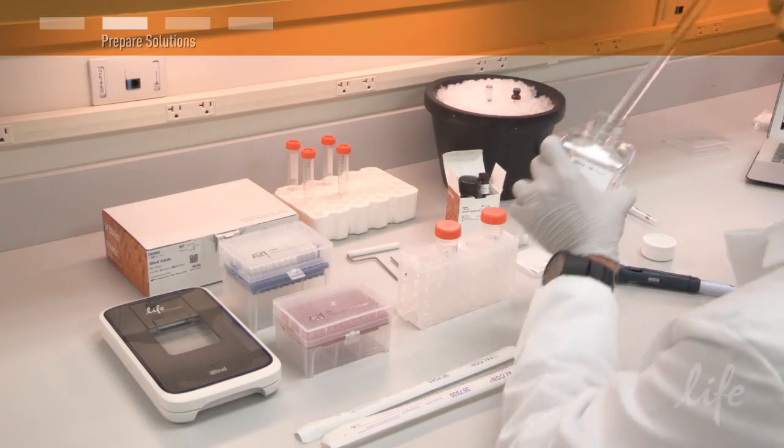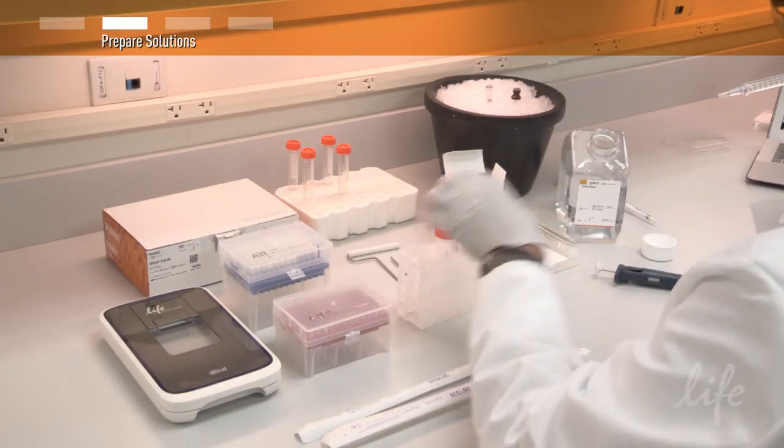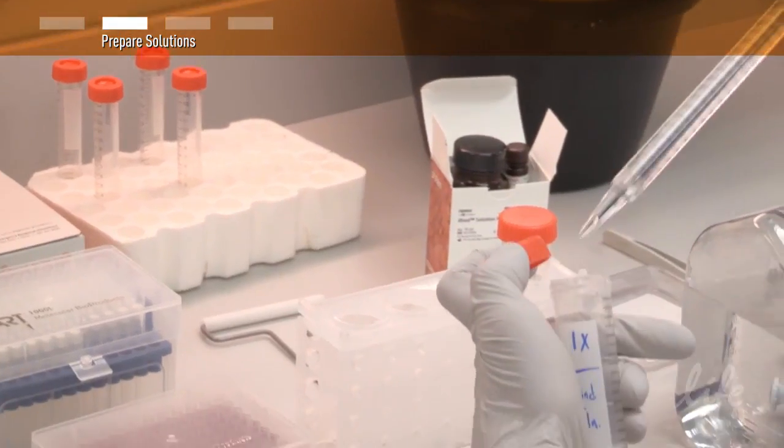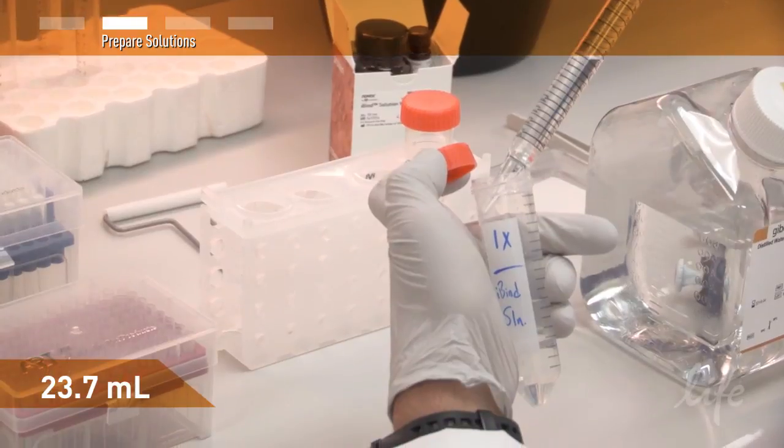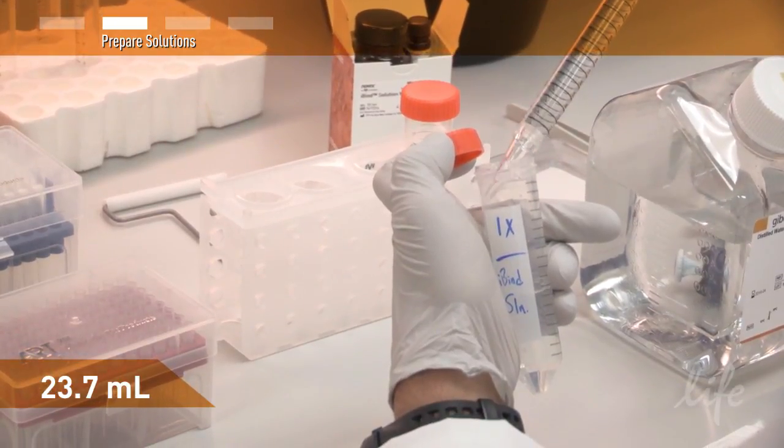The first step is to prepare the 1X iBind solution. To begin, add 23.7 milliliters of deionized water into a conical tube.